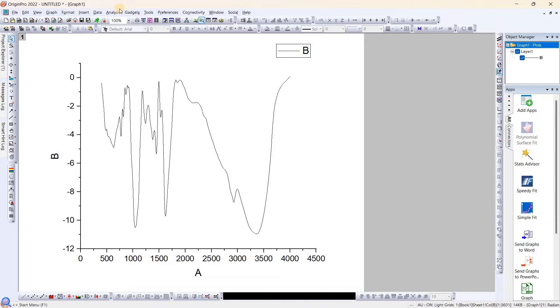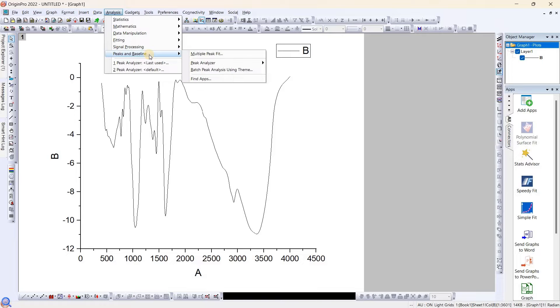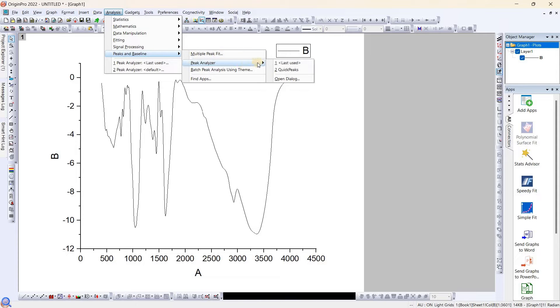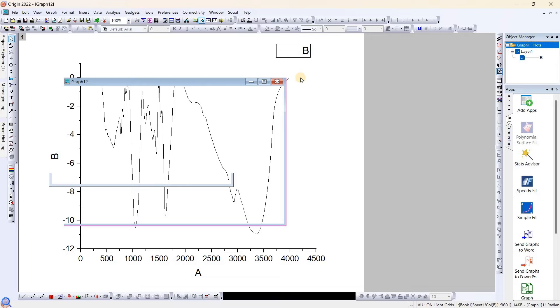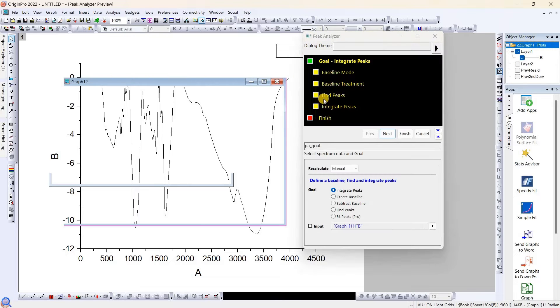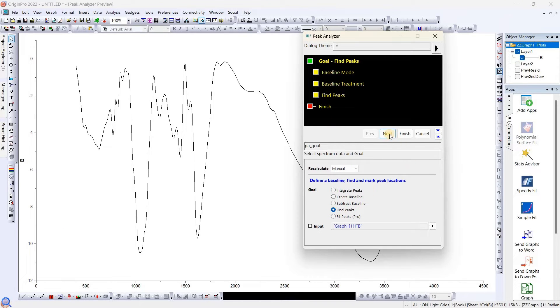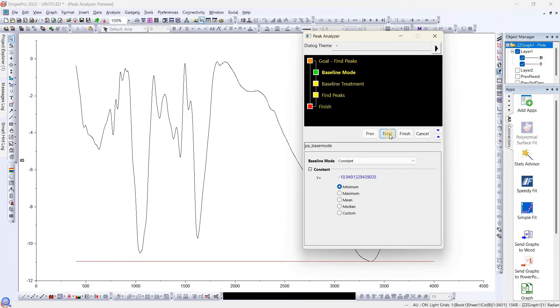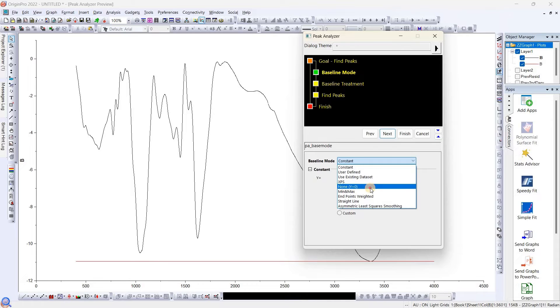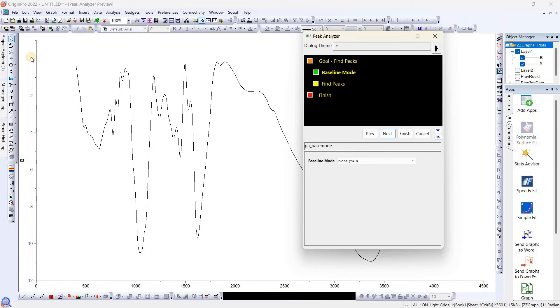In the second method, we will go to Analysis, go to Peak and Baseline, and Peak Analyzer, open dialog. This is one of the methods which I have already shown in FTIR plot. Go to next and here we will choose y equals zero, and go to next.